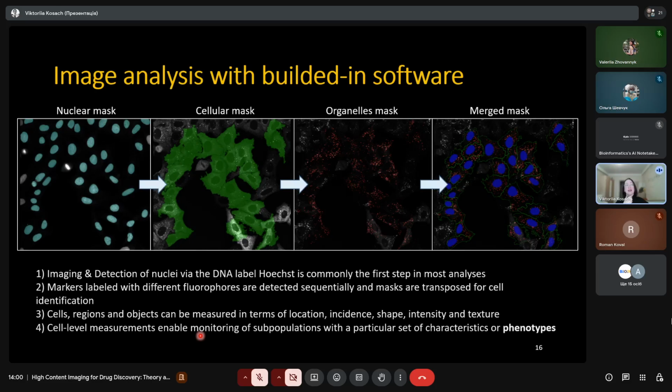Almost all automated microscopes today also have inbuilt supervised machine learning. That is very convenient if you have different subpopulations. If your cells do not answer to the stimuli all alike, but there are different populations that answer a bit differently, in such a case, supervised machine learning inbuilt in the microscope software works very nicely, so very good.